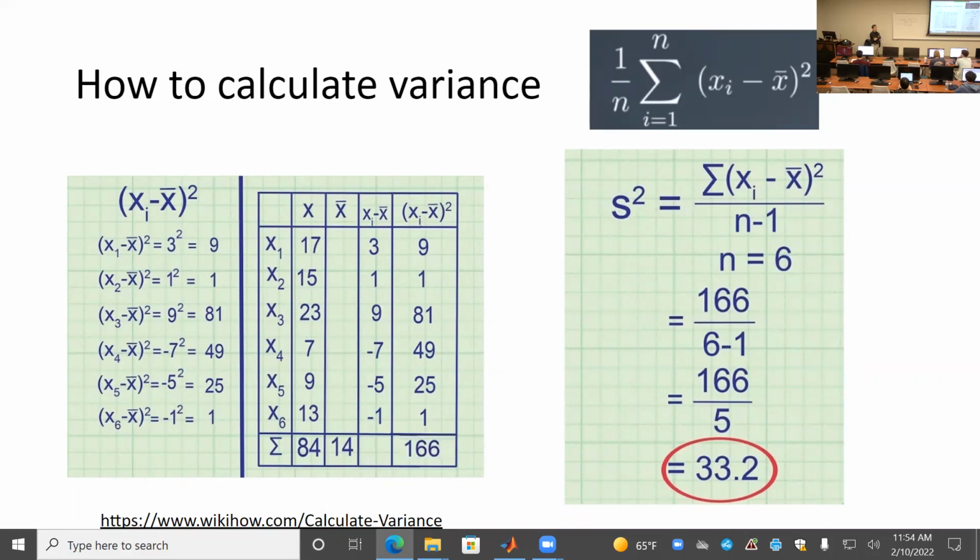So we don't save it unless processing the data takes several hours. Then you want to save your temporary data for later use. But library size normalization costs nothing, so we don't save the intermediate steps of those. Good question.